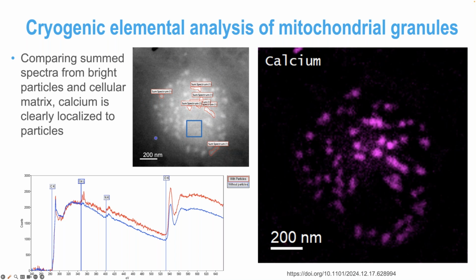We did the manual approach in this example because there were not many data sets to work with, and it was faster time to result to do it by hand. But in an automation pipeline, you might want to do a scripted version of the same thing. And the same person asked, what was the black dot in the middle of the data?